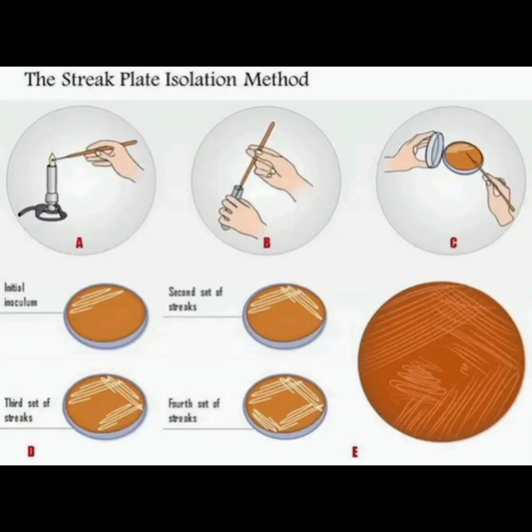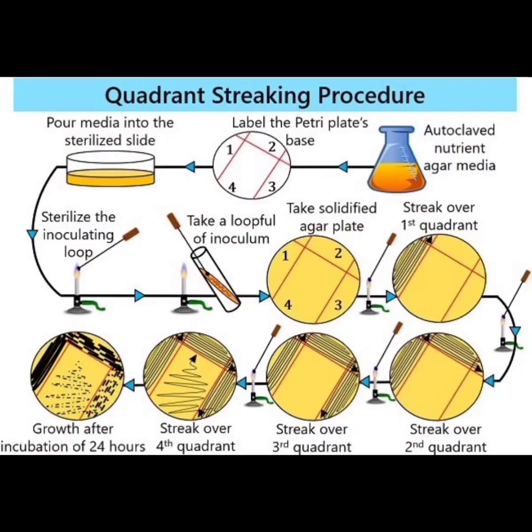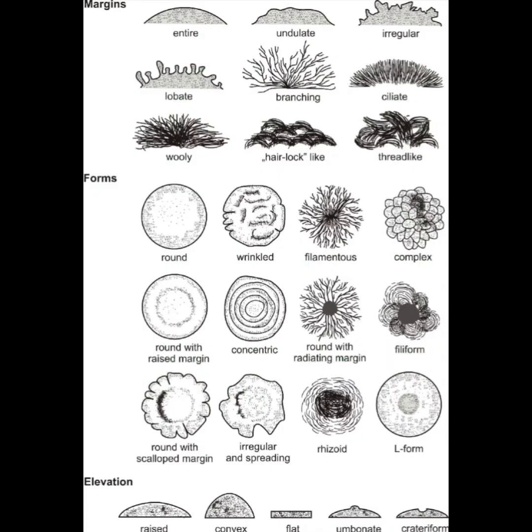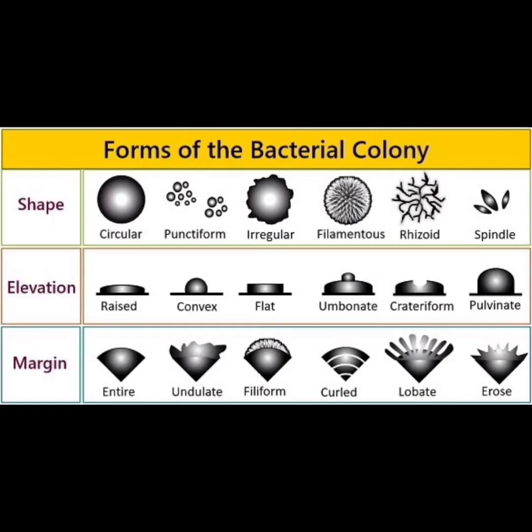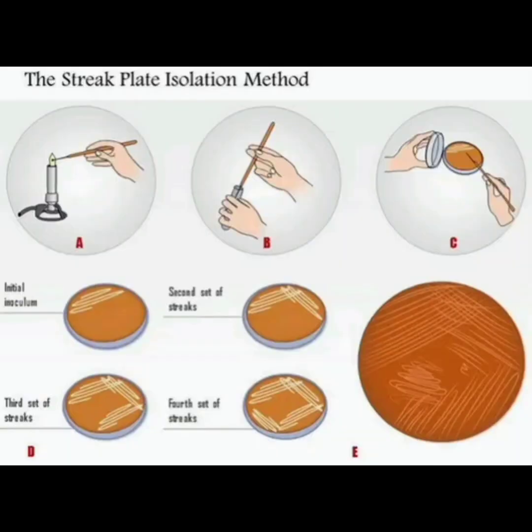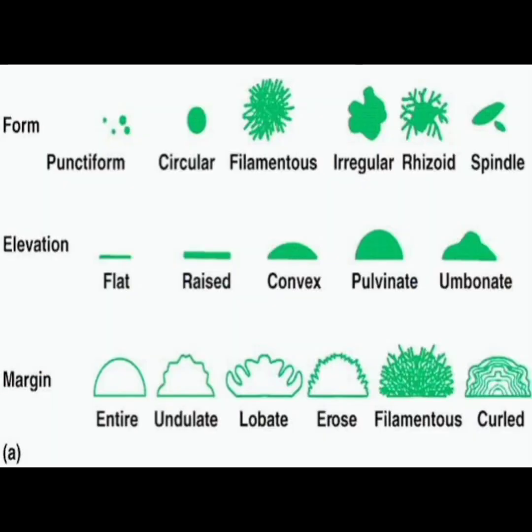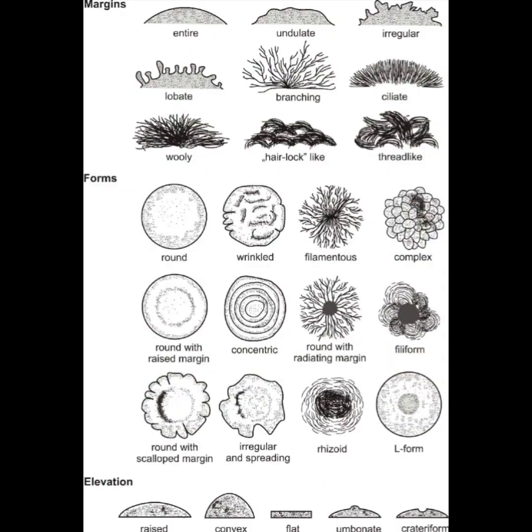Growth pattern on agar is a crucial thing to recognize: the growth morphology of bacterial colonies on an agar slant used for cultivation of pure cultures. The principle used is what we already talked about in the first section of bacterial colonies, that one cell will divide into 2, 4, 8, 1 million, 2 million, and so on. So there is binary fission in colony formation. Eventually a colony appears where the original cell was deposited.